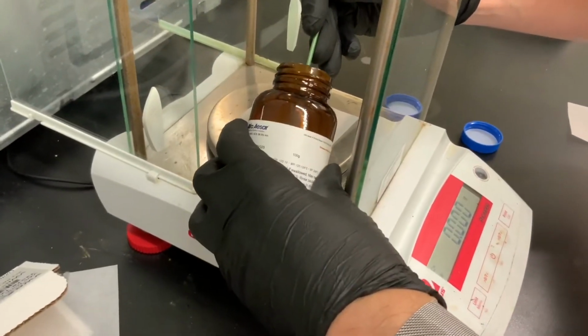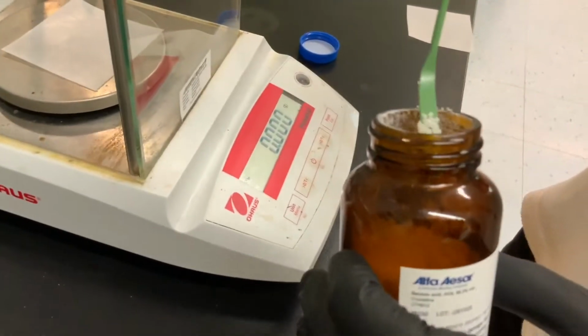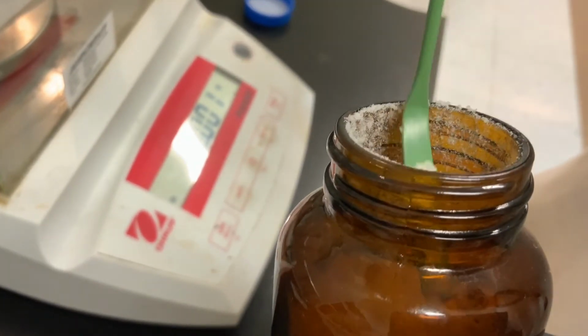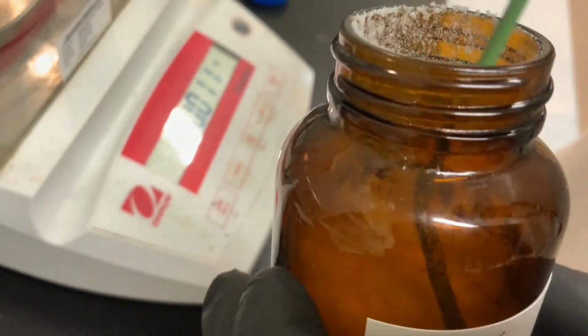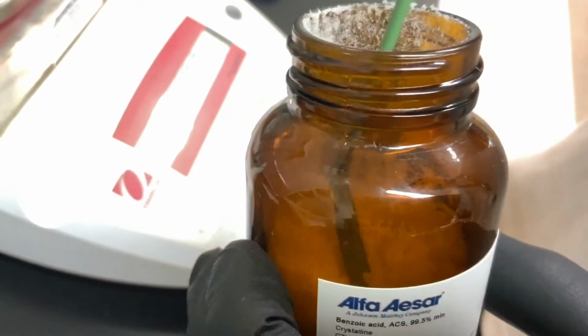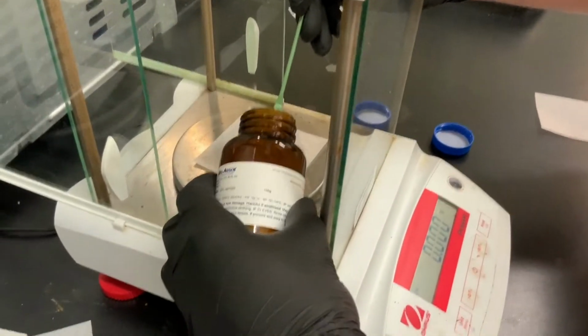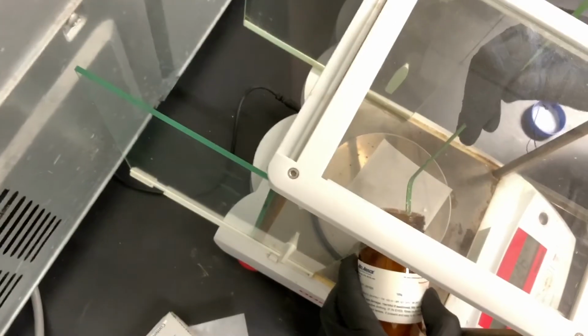So 50 milligrams, well actually let me show you what this looks like first. So here's benzoic acid. You can see it's sort of a shiny white solid. And 50 milligrams is really not going to be that much. So I have both windows open so I can try and do this over the balance. And I just spilled some.